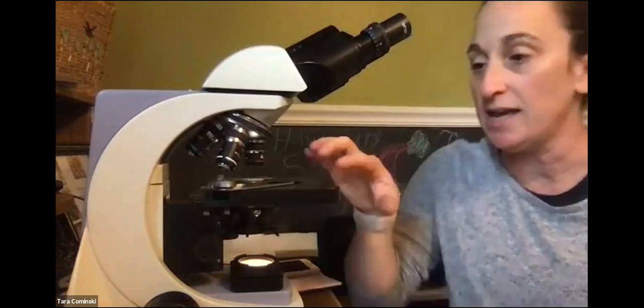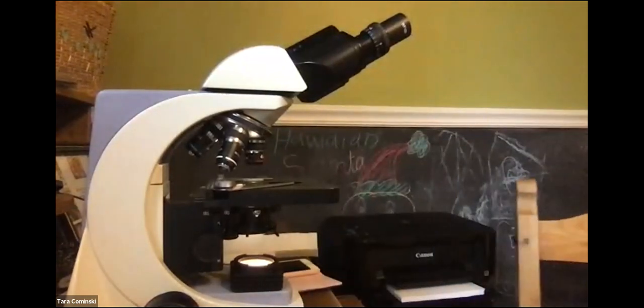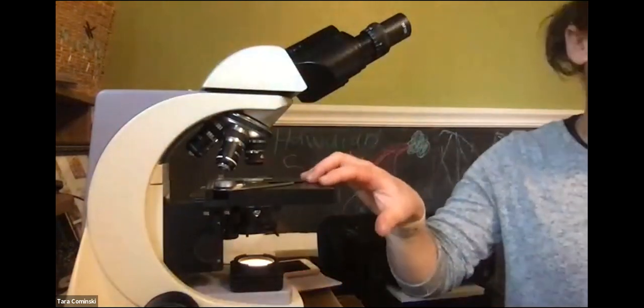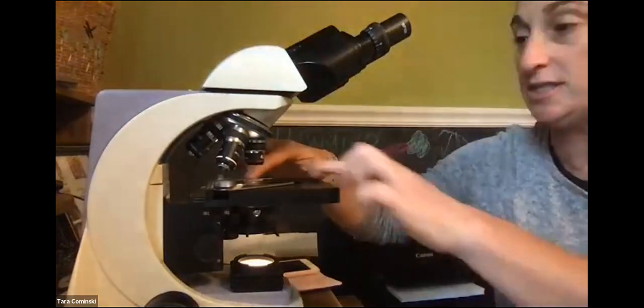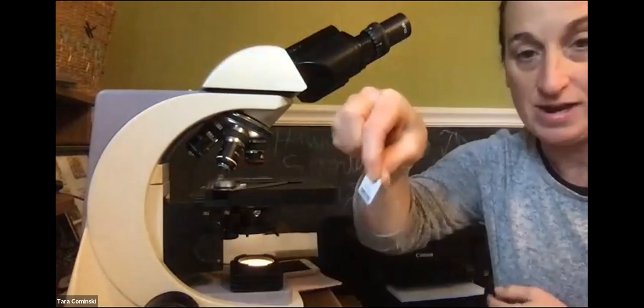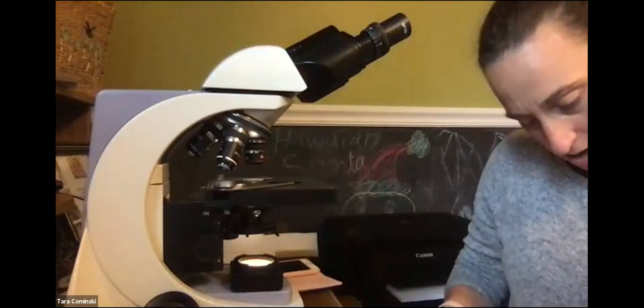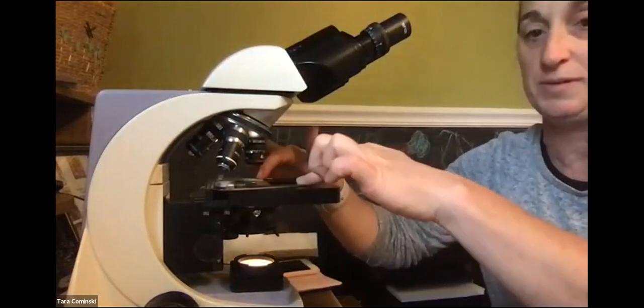All right, so the stage. This is the stage here, okay? It supports the microscope slide. You can see I have a slide right here that I placed in the stage. And you can see this is the stage clip essentially.